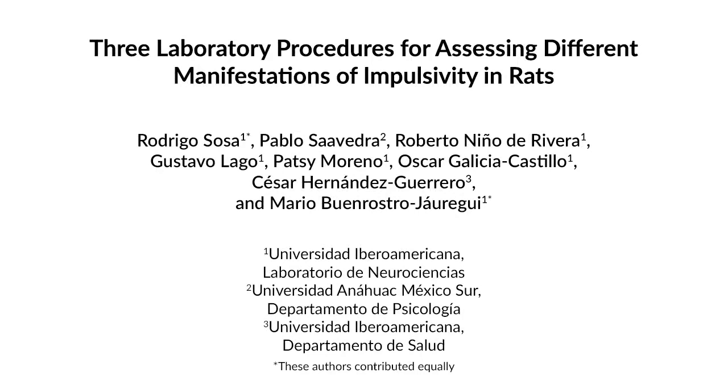Conducting behavioral procedures to assess impulsivity in rats provides insight into the environmental, neurophysiological, and neurochemical basis of impulsivity. That is, about the factors that trigger and underlie those behaviors. This protocol allowed the study of impulsivity with a good balance of efficiency and accessibility, and the extraction of data suitable for quantitative analysis. The performance in these protocols may be considered as an analog of impulsiveness in humans.